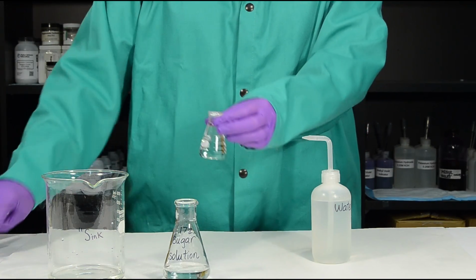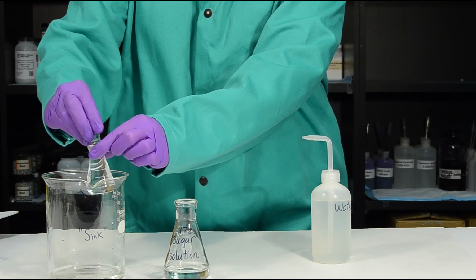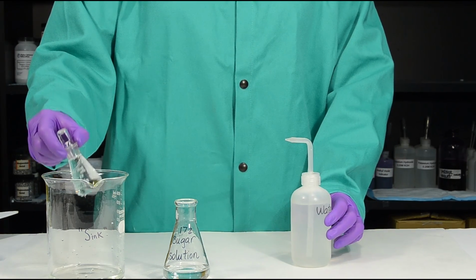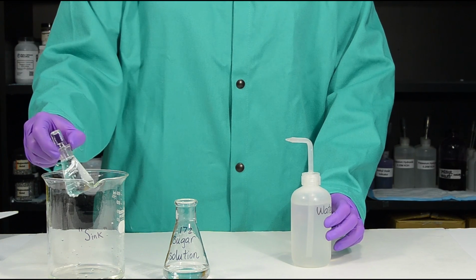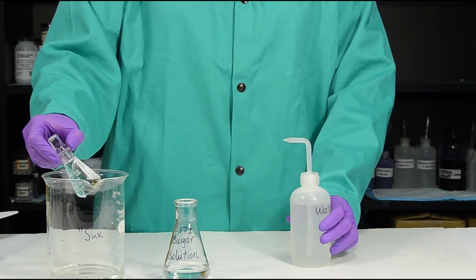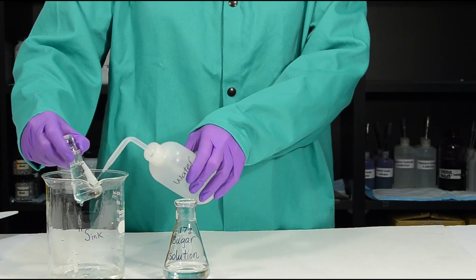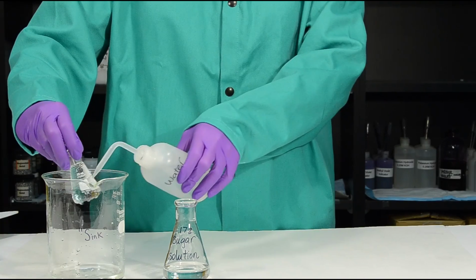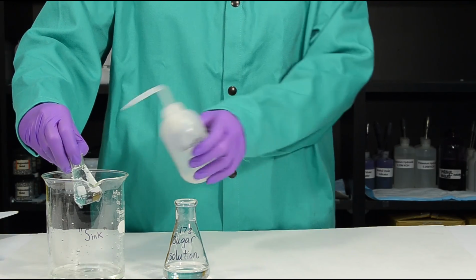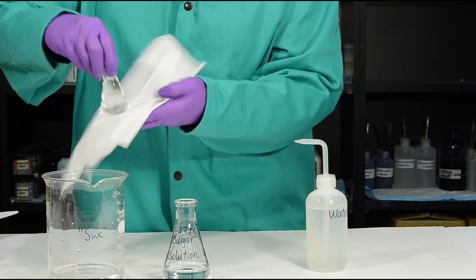Once you have filled your solution to the lip, over the sink, displace the solution with the stopper again. You should always fill your solutions over the sink so that you don't get sugar solution all over the bench tops, because everything will get sticky. Next, rinse the outside of your Erlenmeyer flask with water to remove any solution left on the outside of the flask. Finally, dry your flask with a paper towel.